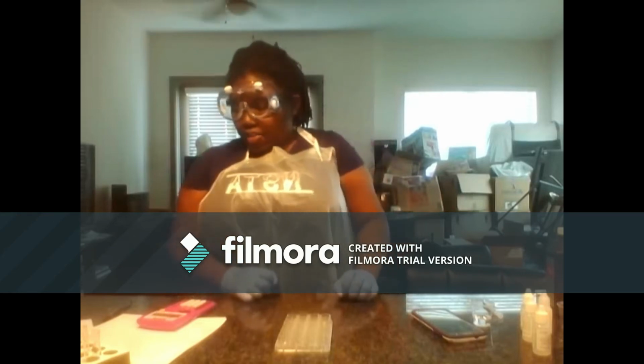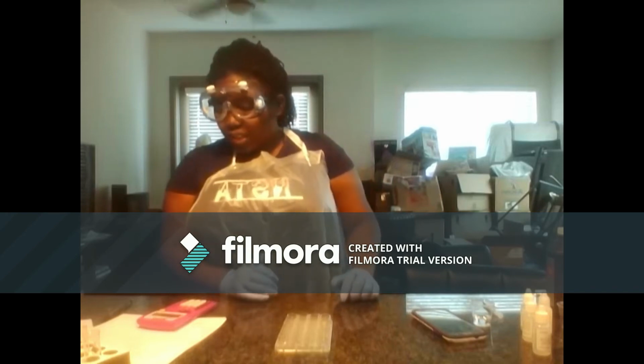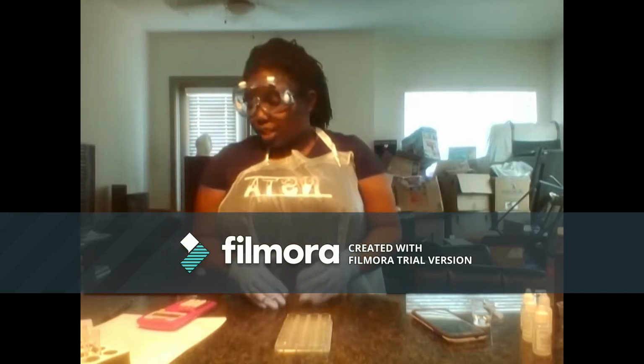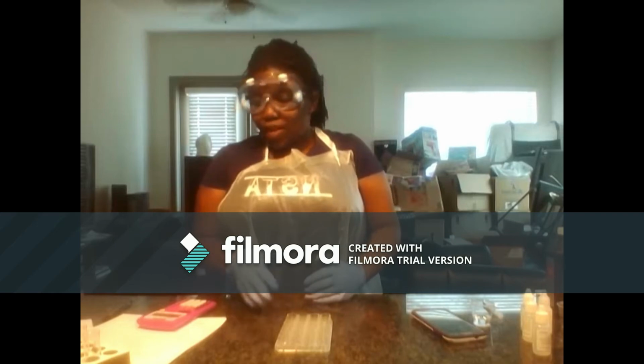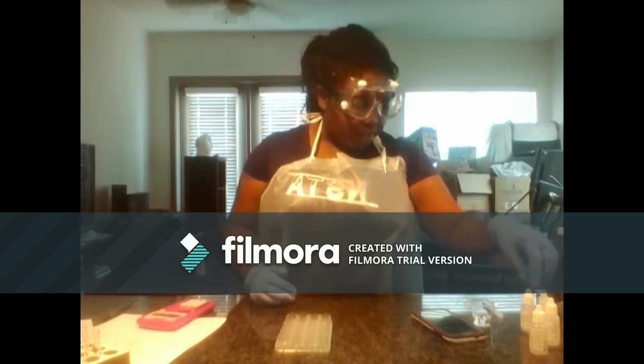Okay, so I have returned and I've cleaned my well plate, and so I will prepare to do trials 5 and 6, and I'll do one on camera and then I'll do the consecutive one to follow, and I'll record my times, just to save a little bit of time on the video.